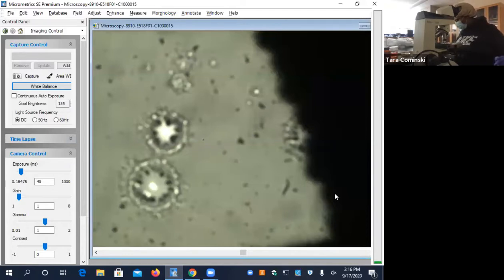Okay. All right. So you guys have a slide here. I'm going to get you a little piece of onion. So we're going to make a slide of onion tissue and look at some onion cells. We're going to use this blank slide. And then you're going to need these cover slips. So first, just start with that slide, and I'll get you guys these onions. We're trying to get you as thin as you can.